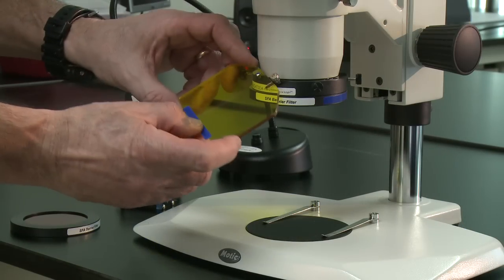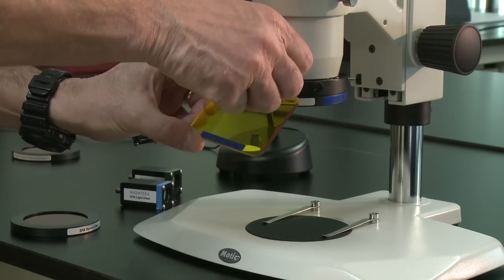The adapter also holds a viewing shield that matches the barrier filter. That's really all there is to it — a fluorescence exciting light source and barrier filter system that lets you adapt your existing stereo microscope for fluorescence work in just seconds.